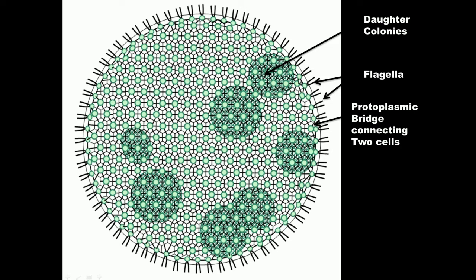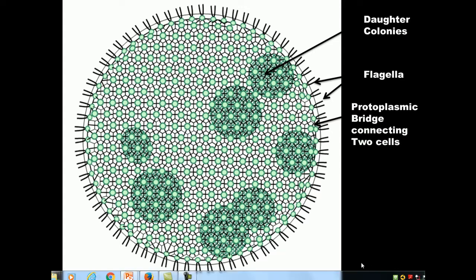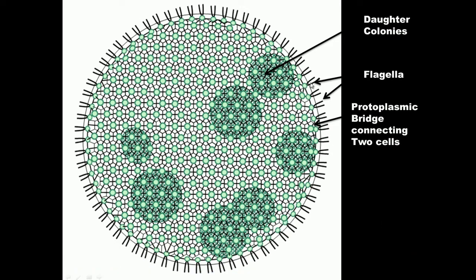The outside of the ball are these little colonial somatic cells with two flagella each, and each of these cells are connected by a protoplasmic bridge.